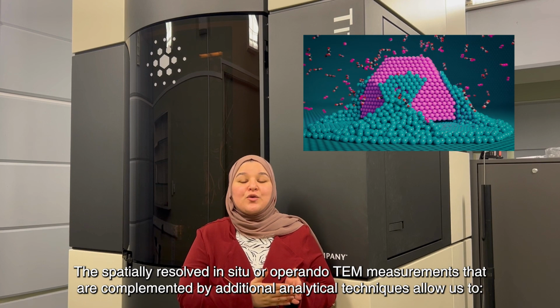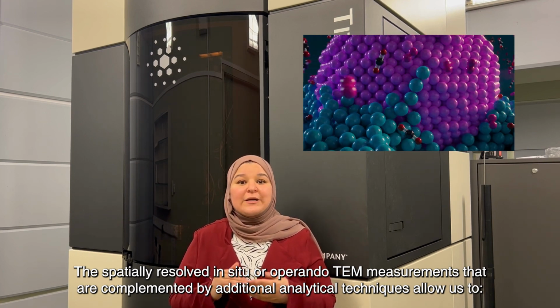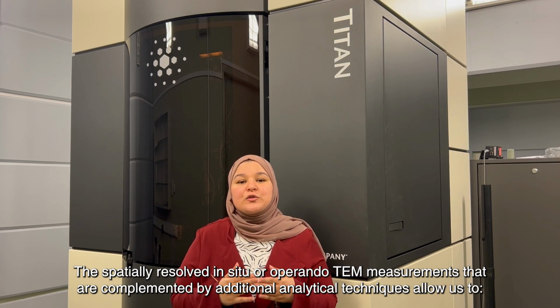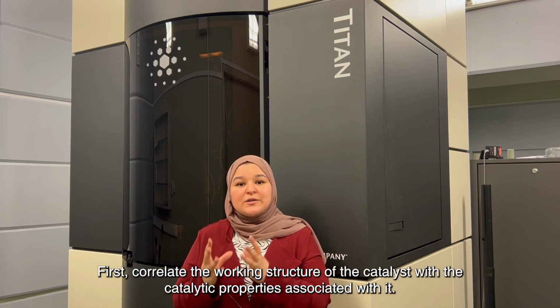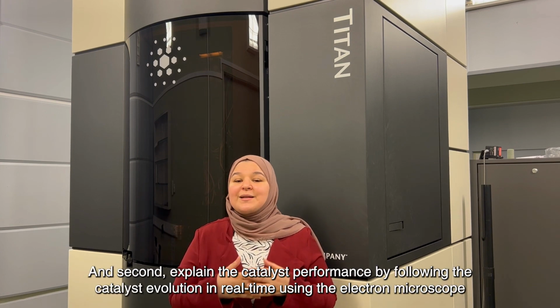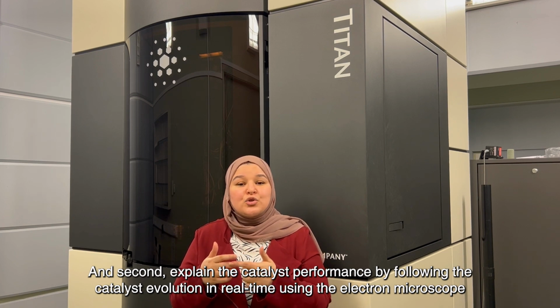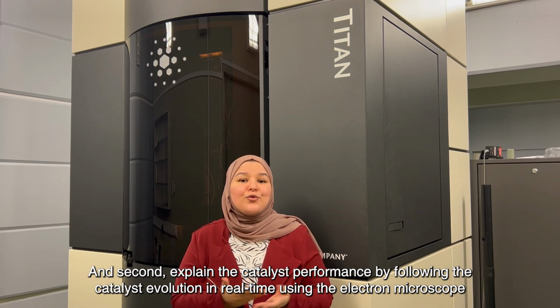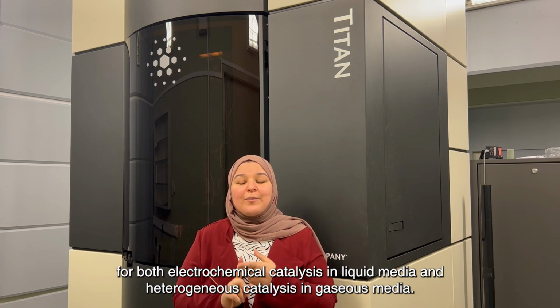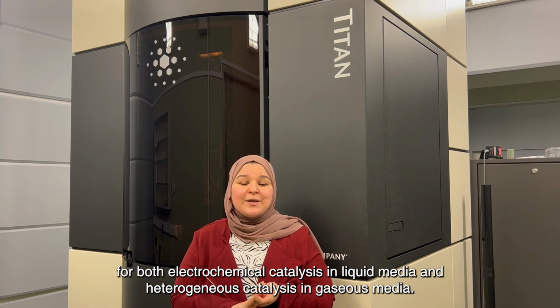The spatially resolved in situ or operando TEM measurements that are complemented by additional analytical techniques allow us to first correlate the working structure of the catalyst with the catalytic properties associated with it, and second, explain the catalyst's performance by following the catalyst evolution in real time using the electron microscope for both electrochemical catalysis in liquid media and heterogeneous catalysis in gaseous media.